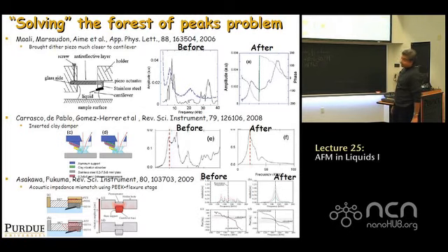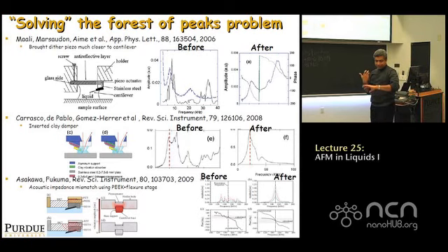Not surprisingly, there are two ways generally of doing it. So remember, the peaks occur due to the piezo causing a resonance of all these other structures. Each peak is a resonance of one of these structures. So you can do two things. You can bring the piezo close to the cantilever, right?